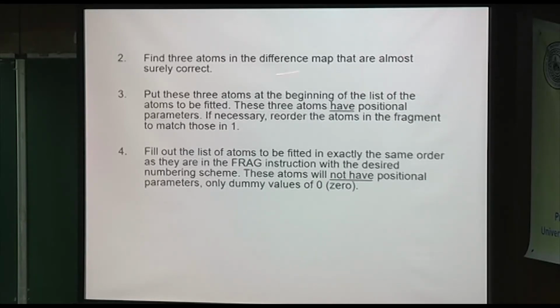So again, the first 3 atoms are the only ones that really matter. You put them at the beginning of the set. Make sure they're exactly in the same order. One maps onto the other.